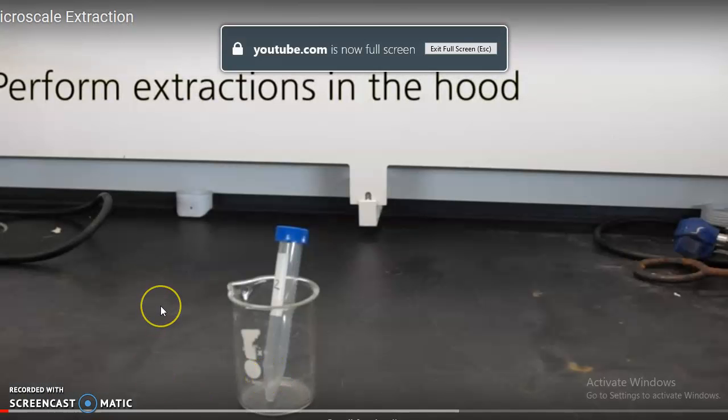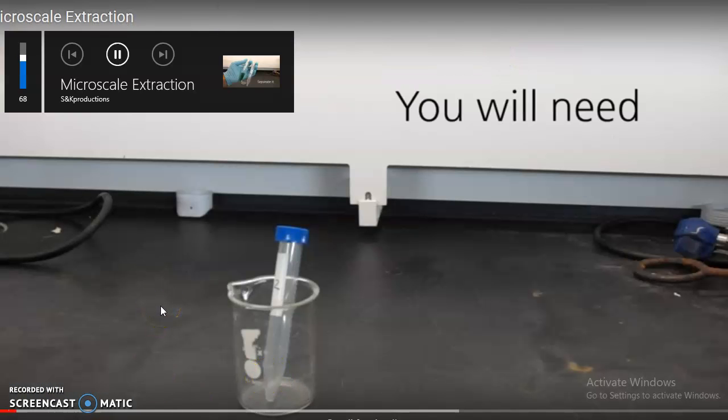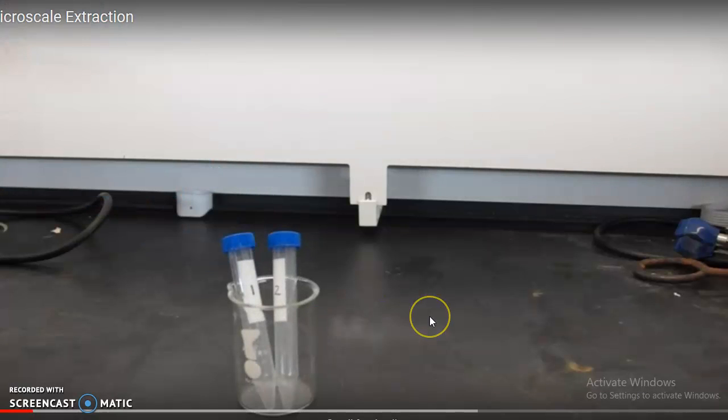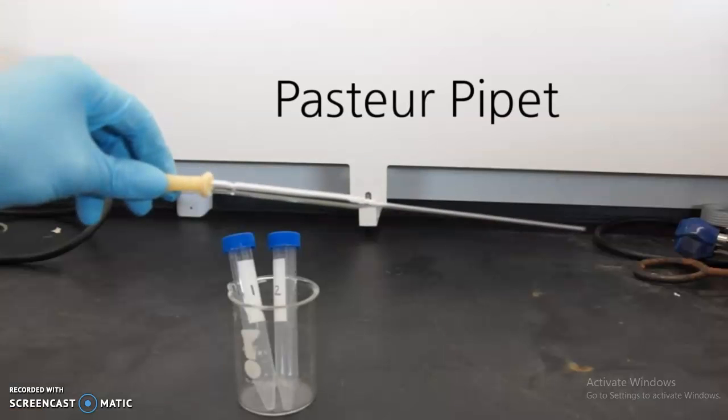Remember to wear gloves and perform extractions in the hood. Here's what you'll need. Some Falcon tubes and Pasteur pipettes.